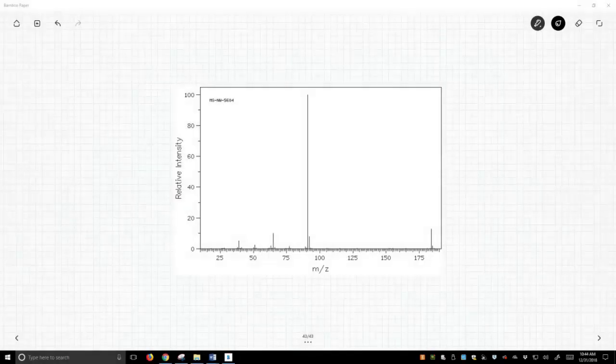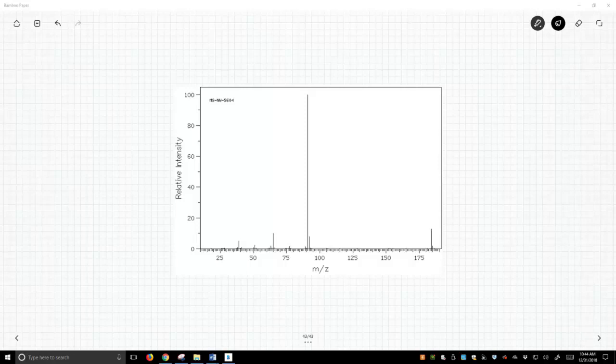Okay, on the screen right now is a mass spectrum, and this mass spectrum is characterized by this huge peak with an m/z of 91.